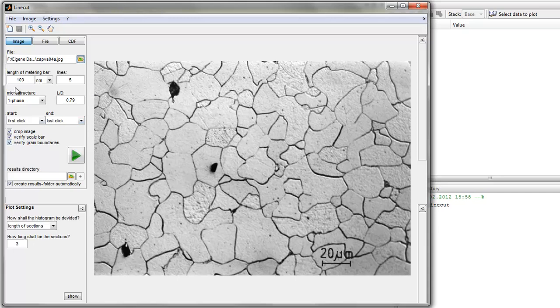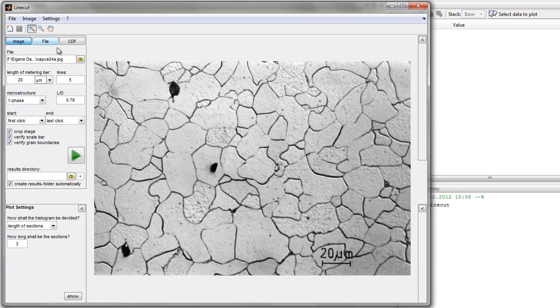First of all you have to scale the metering bar so you read out 20 micrometers. If you can't read it at this size you can zoom in or zoom out with this tool.